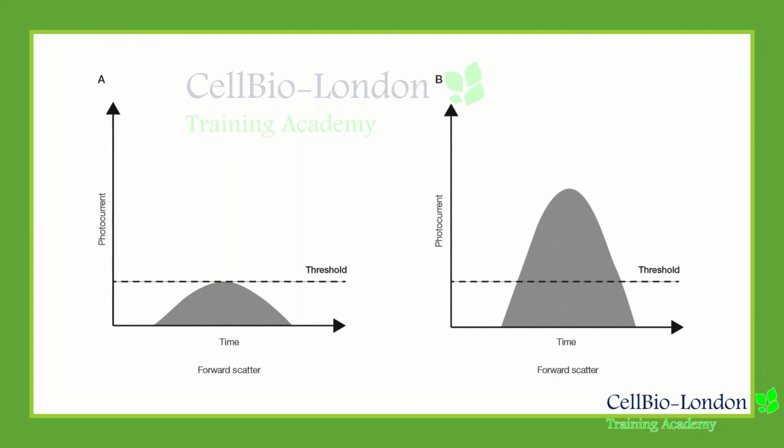The measurement from each detector is referred to as a parameter. Each parameter can be displayed in height, area, and width values, and on the histograms and dot plots in the flow cytometry software. These are used to measure fluorescence intensity, compare populations, and designate sorting decisions. So in the next lecture, I will talk about fluorescent markers, fluorescent proteins, and discuss common fluorophores used in flow cytometry.